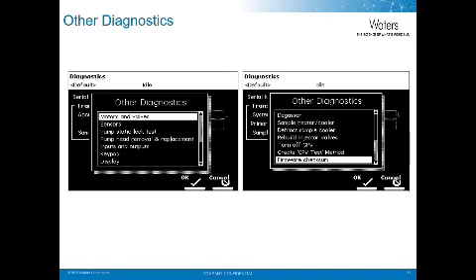Inline degasser. It checks the degasser, and then firmware displays the firmware version and the checksum. Defrost sample heater cooler defrosts the sample heater cooler. GPV turns the GPV on and off, and injector valve rebuild moves the spool so that it can be replaced when rebuilding a high-pressure motorized valve.